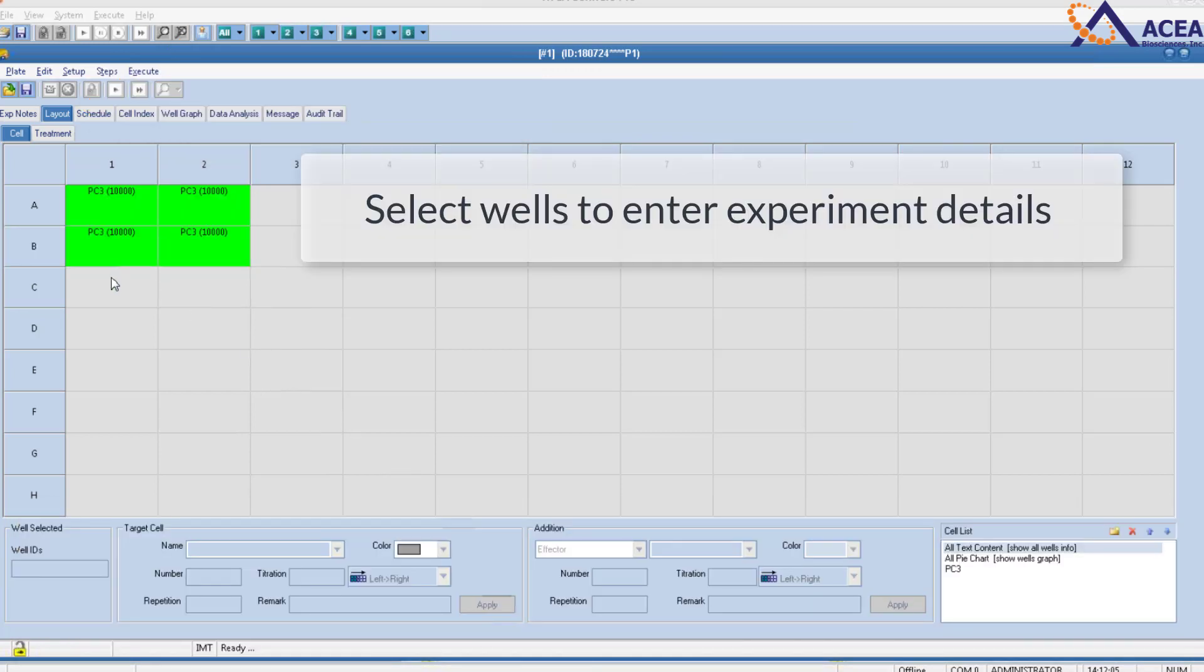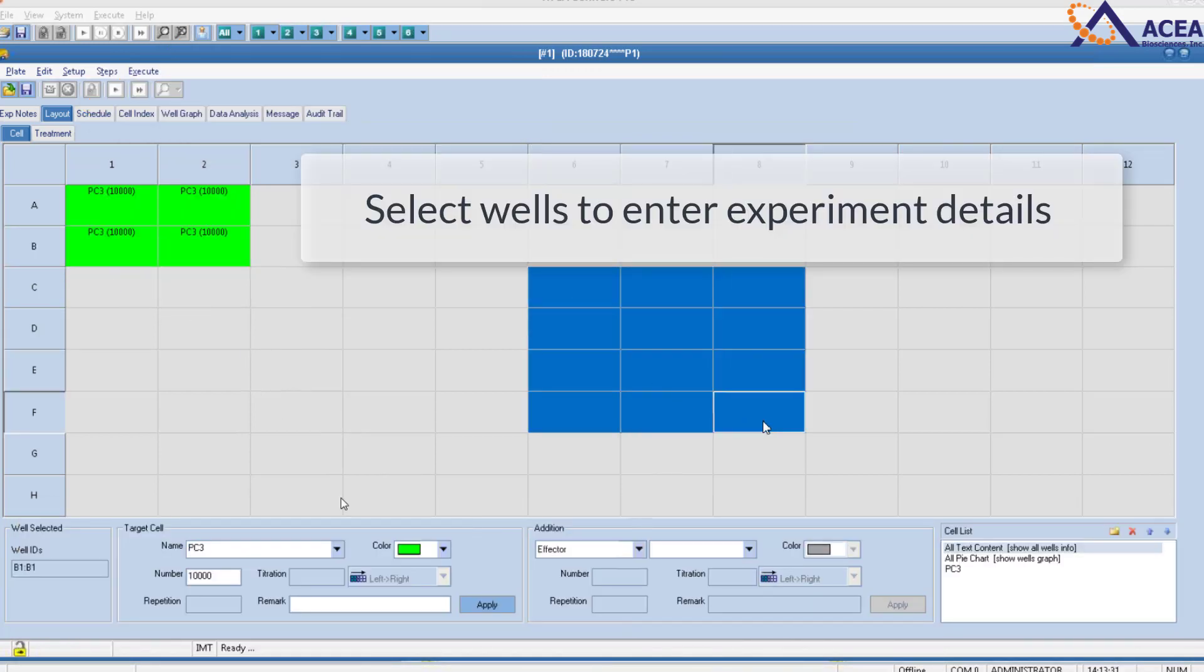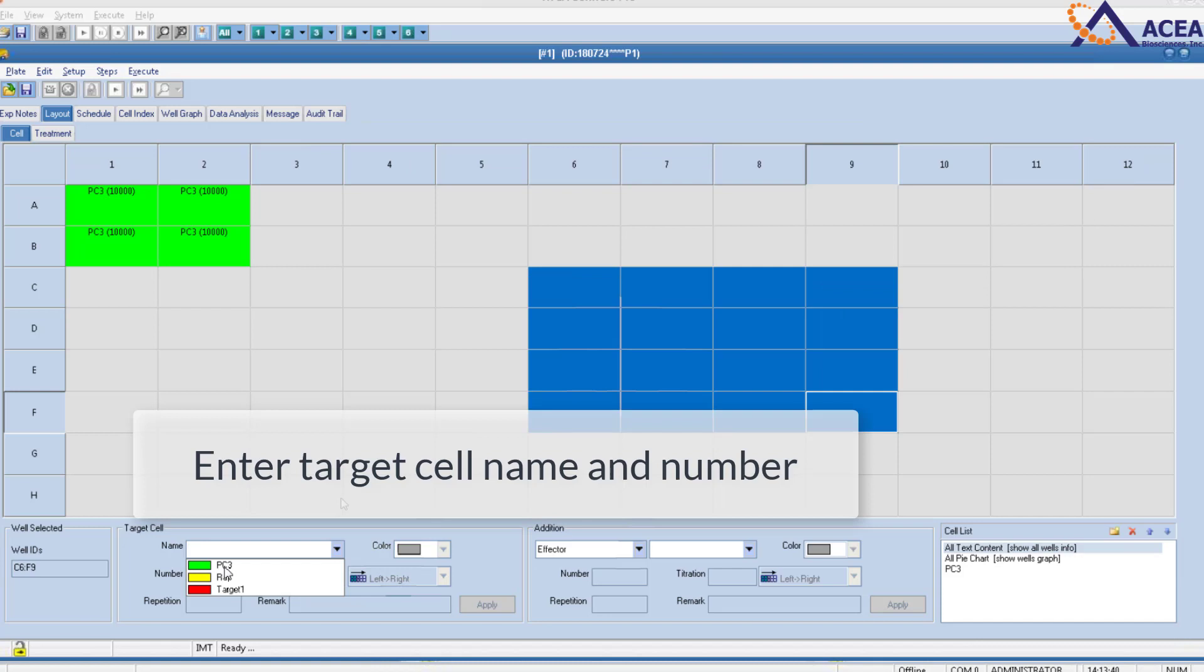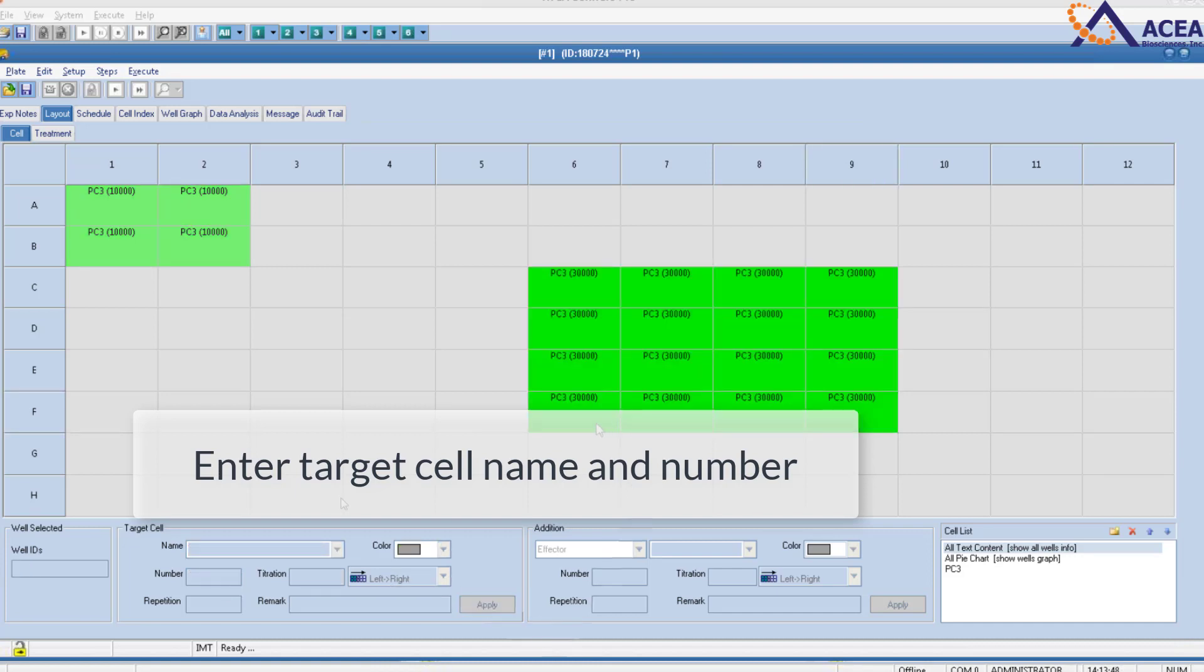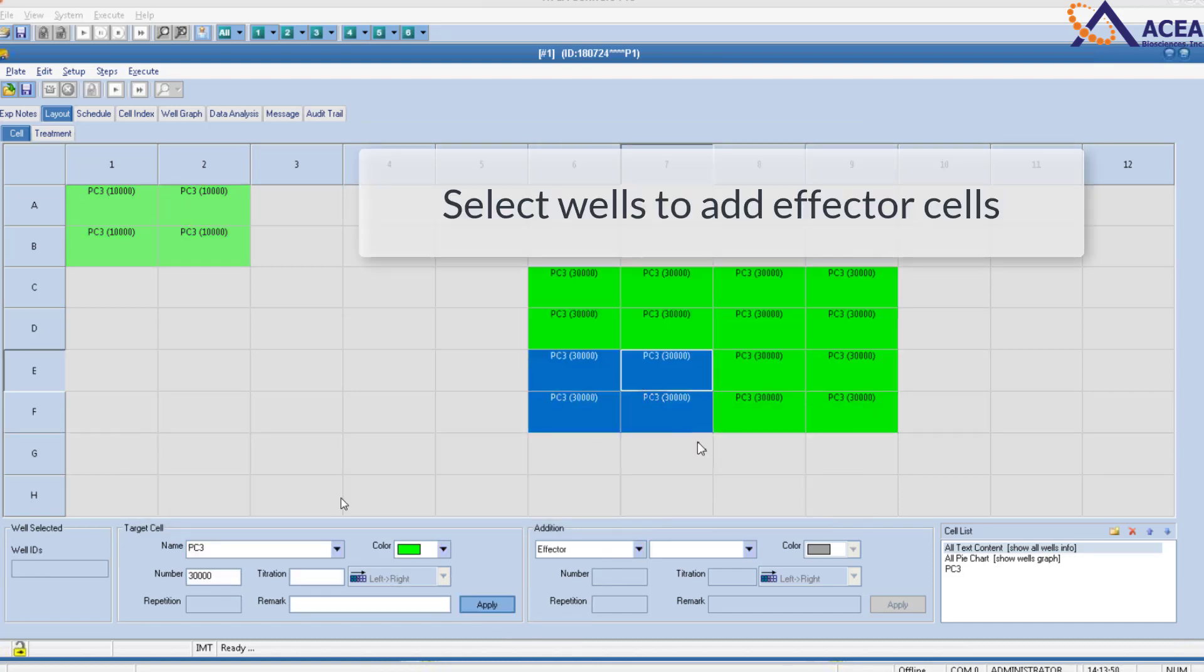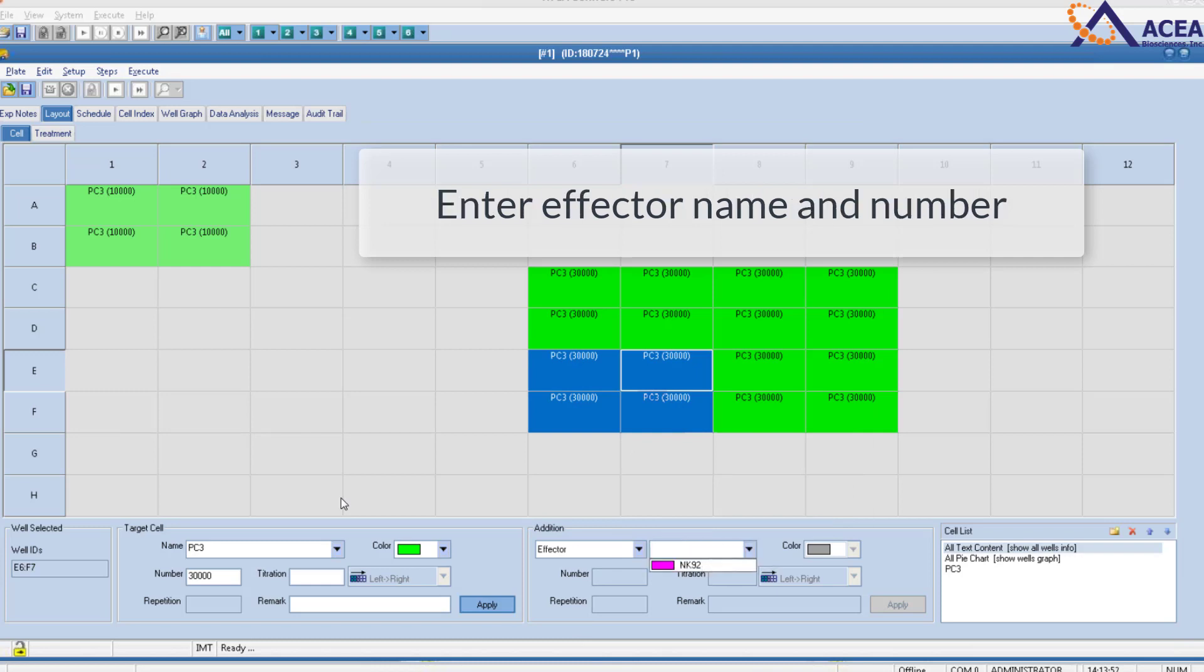You can select wells to enter experiment details. Then enter the target cell name and number. Select wells to add effector cells, and enter the effector name and number.